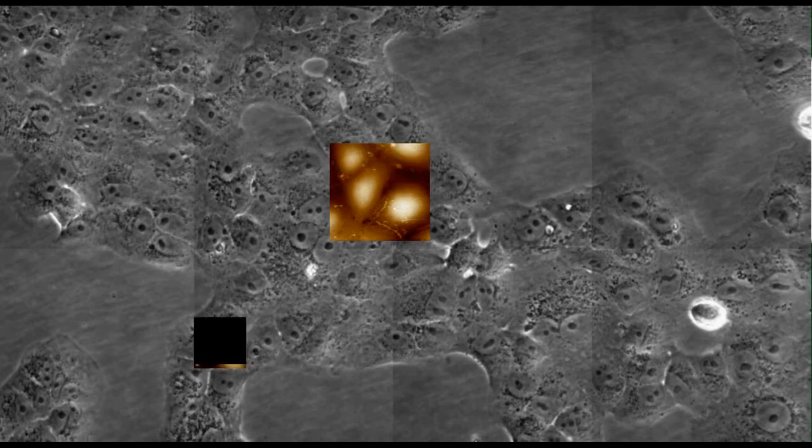Whether you wish to determine the biomechanical properties of plant cells, cartilage, bone or tissue samples, or measure cell-cell or cell-substrate interactions, the hybrid stage gives you the flexibility you need to study the widest range of samples.